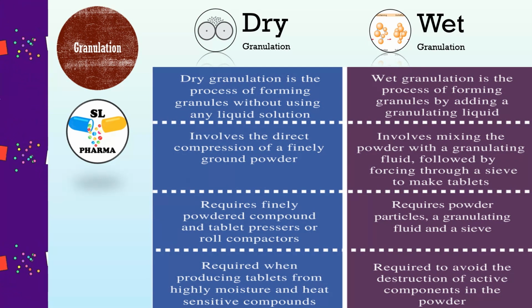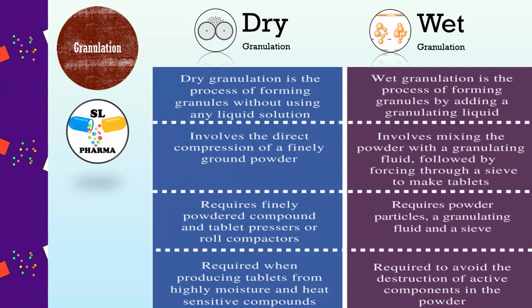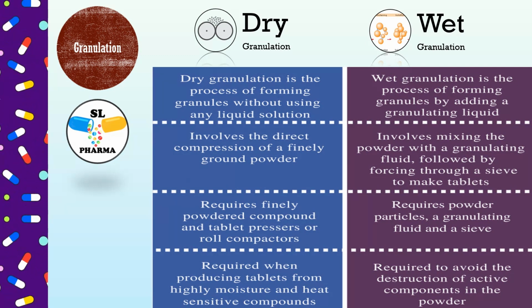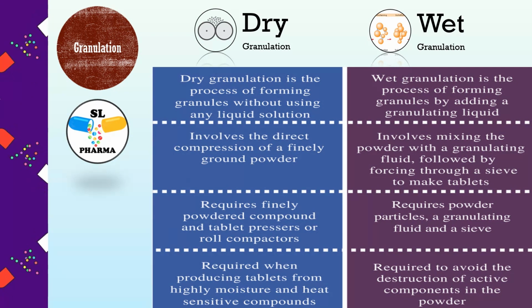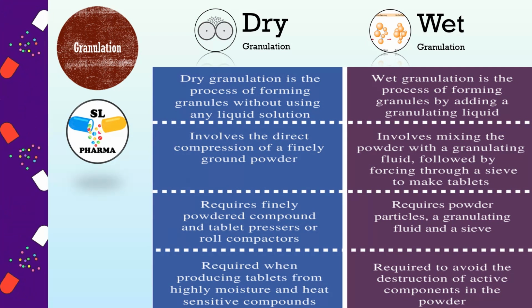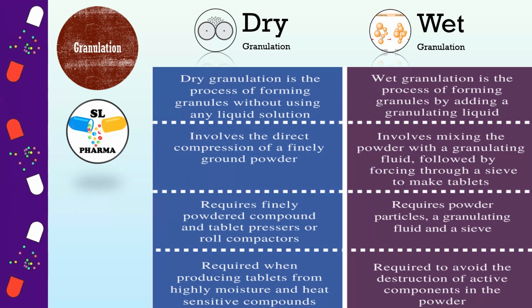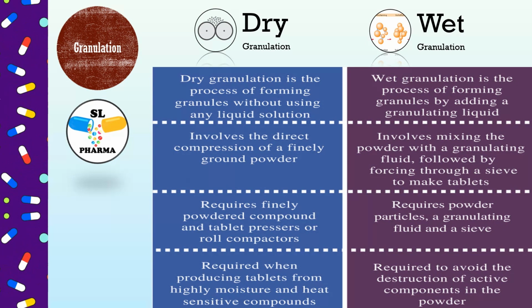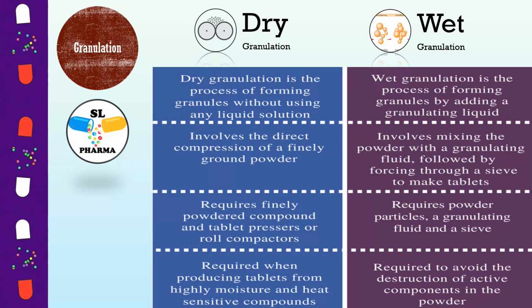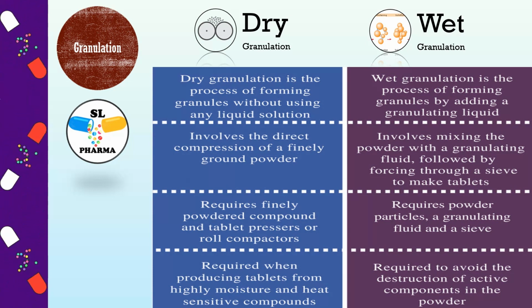Wet granulation is a widely used technique that produces granules via wet massing of the active pharma ingredient, API, and granulation liquid with or without a binder. Wet granulation is carried out in two ways. One method is to moisten the powder or powder mixture and pass it through a screen of the mesh size needed to produce granules in the desired size using dry heat.